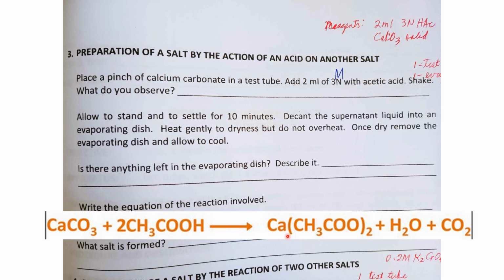And the product is calcium acetate. We decanted the supernatant into an evaporating dish, and the supernatant is heated to dryness. This is the product. This is a white salt. This will be the one left in the evaporating dish.